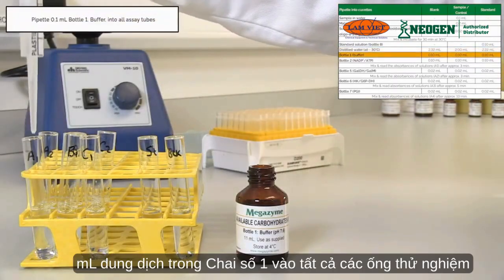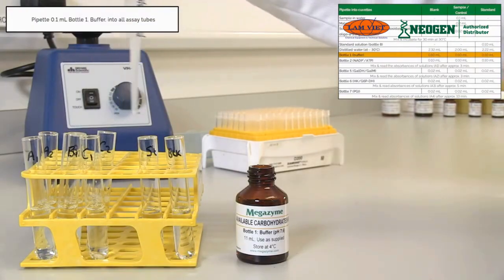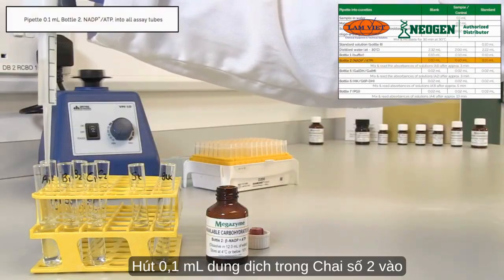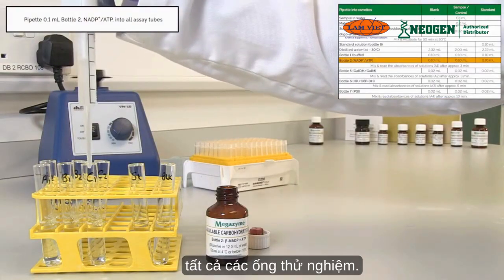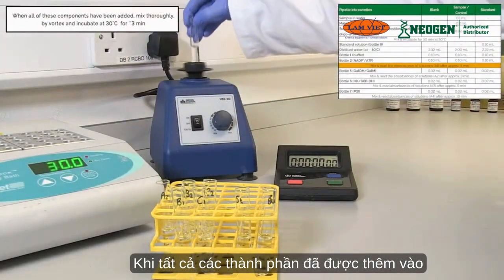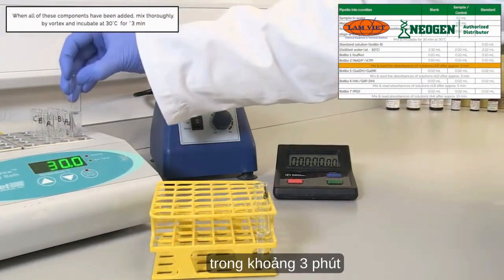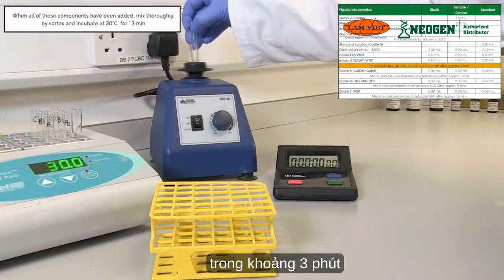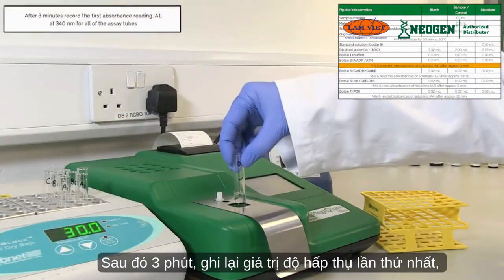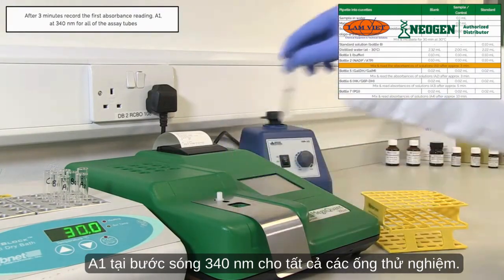Pipette 0.1 ml of the contents of bottle 1, imidazole buffer, into all assay tubes. Pipette 0.1 ml of the contents of bottle 2, NADP plus and ATP, into all assay tubes. When all of the components have been added, mix the tube contents thoroughly and incubate the tubes at 30 degrees Celsius for approximately 3 minutes. After 3 minutes, record the first absorbance reading, A1, at 340 nanometers for all of the assay tubes.